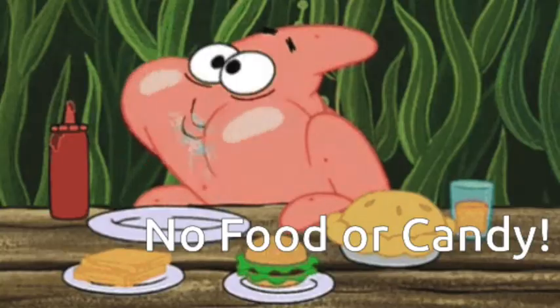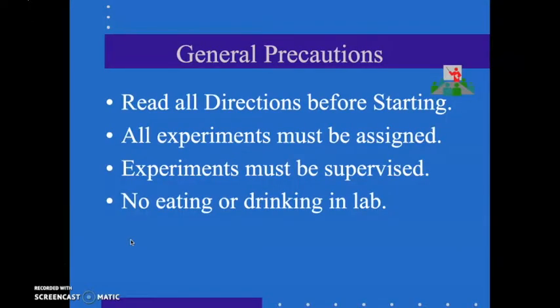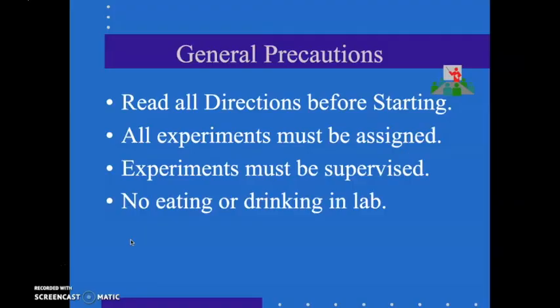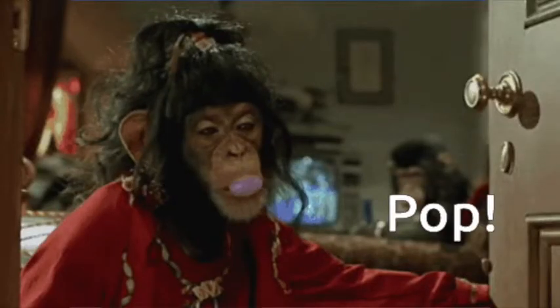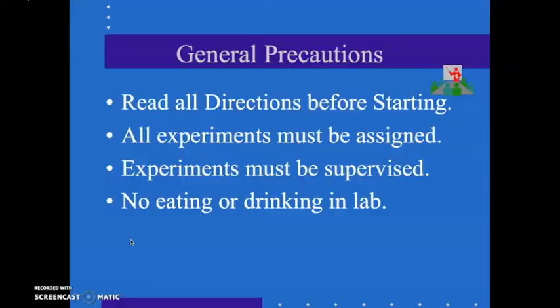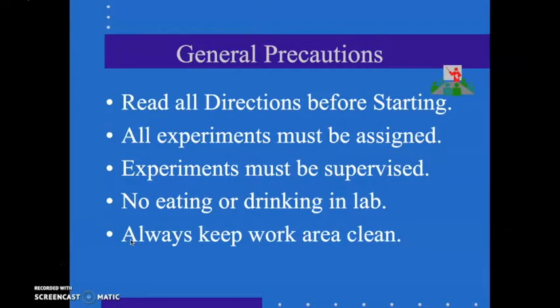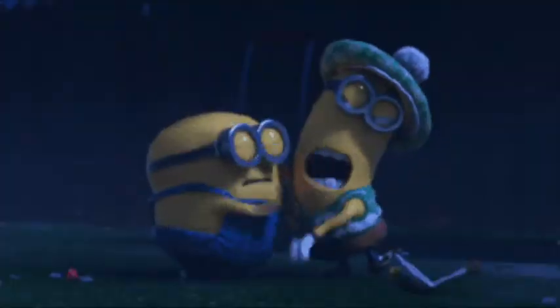No eating or drinking in the lab. Very, very dangerous, guys. There's something called toxicity, where you can poison yourself, not knowing that somehow, like on gum or candy, something has been placed on it. Always keep work area clean. No messy areas. Again, don't horseplay. Don't play around.